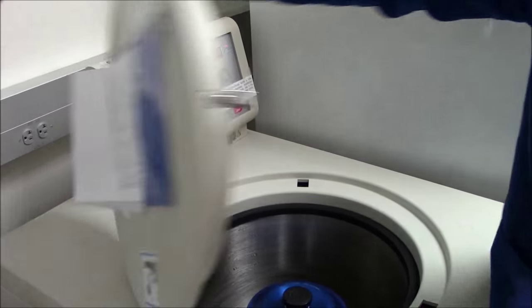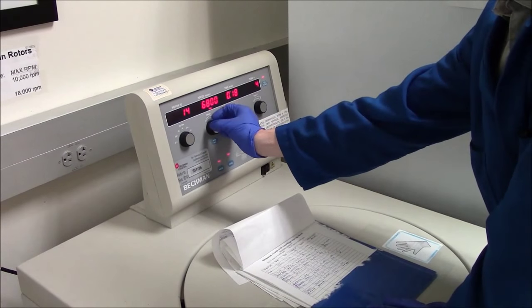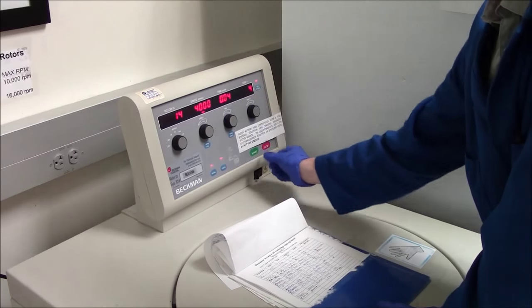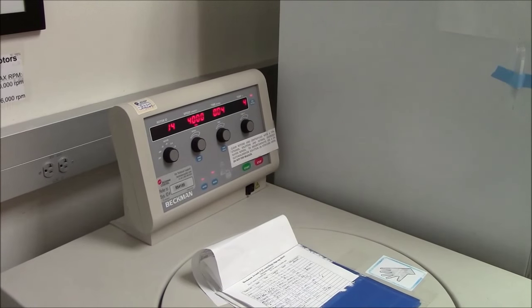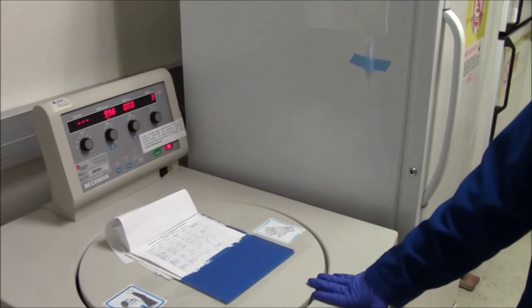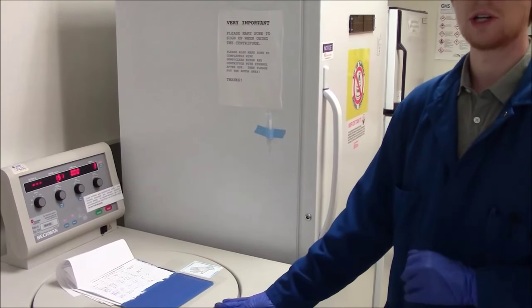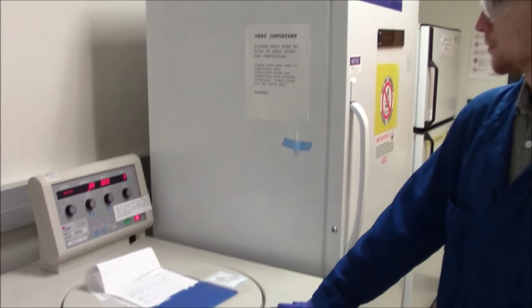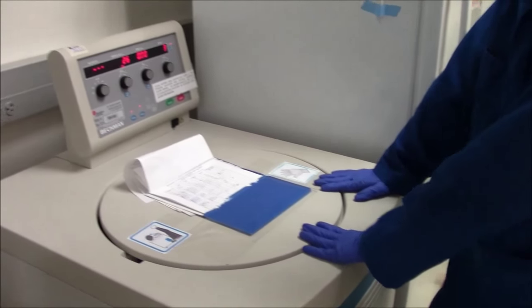We'll spin these again at a slower speed. This is just 4,000 RPM for just 4 minutes. This will dry out the pellet a little bit, separating the phage from the remaining supernatant. There's still a little bit of excess. This will come out with a small volume of liquid, maybe 2 or 3 milliliters, that you want to keep separate from the phage pellet. So just be thoughtful and observant as you take the bottles out. Don't shake them up.